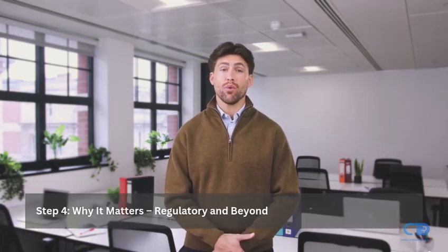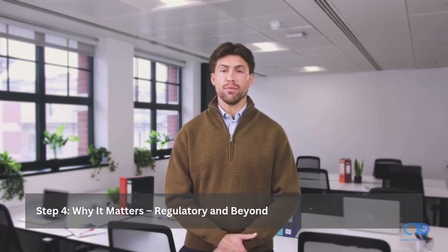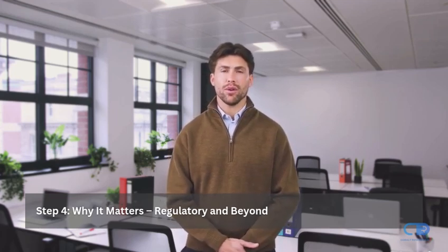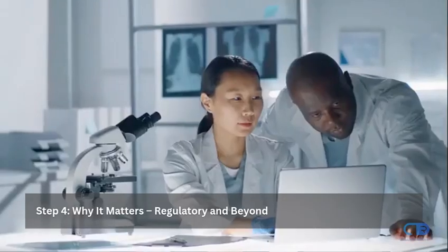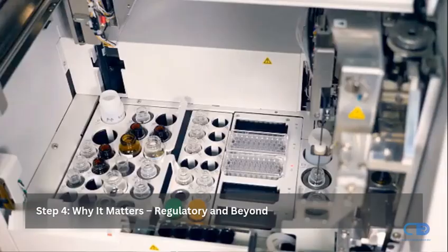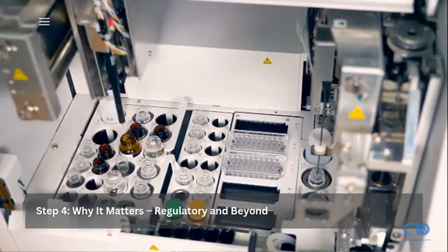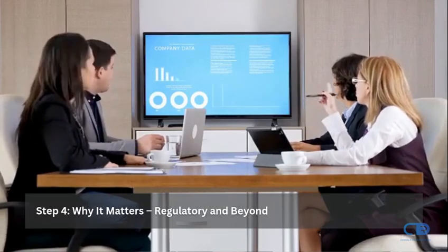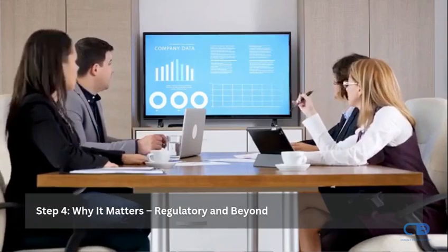Final step: why it matters. A poorly validated method equals unacceptable data, and a submission could be rejected entirely for a single analytical issue. Many companies lose months of progress because their method validation is incomplete, inconsistent, or poorly documented. That's why method development isn't just about running a machine, it's a core part of your regulatory strategy.